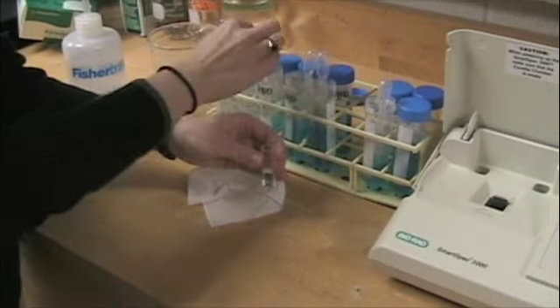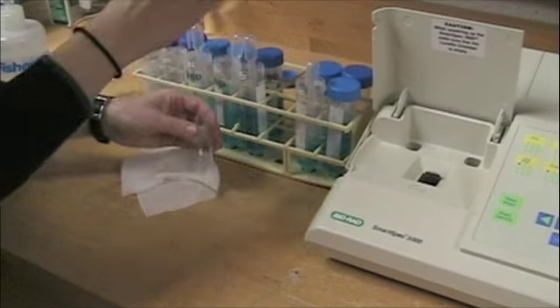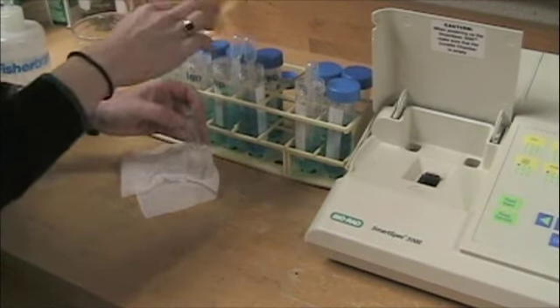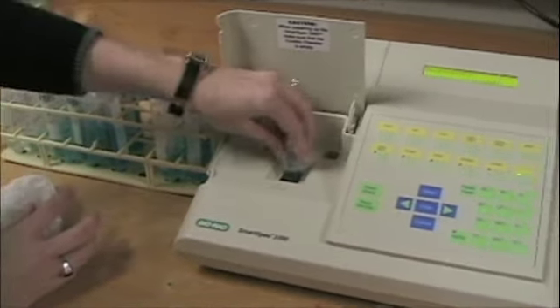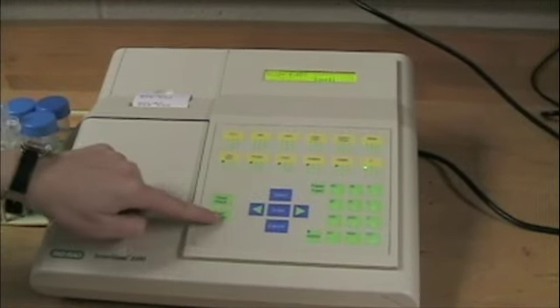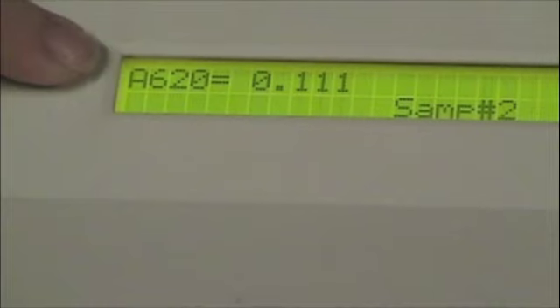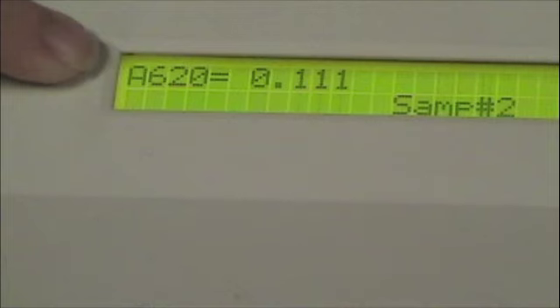Same procedure. Fill the pipette, put it into the cuvette, wipe off any fingerprints, put it in. I'm going to press read sample, and here is our absorbance for sample number 2. So make sure you record that one as well.